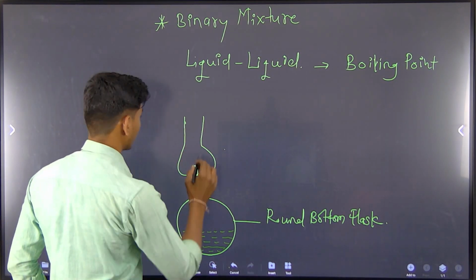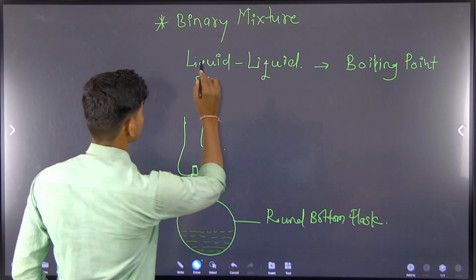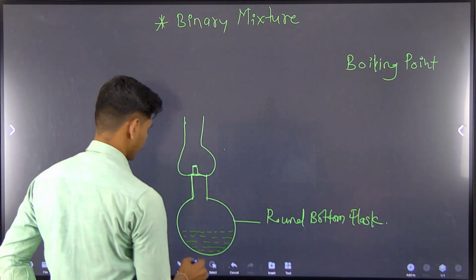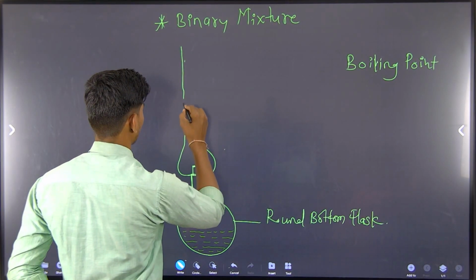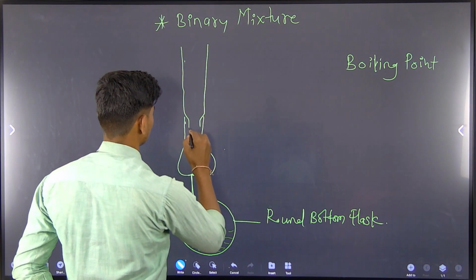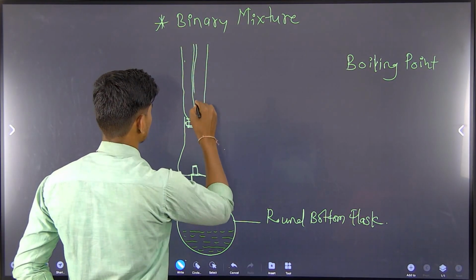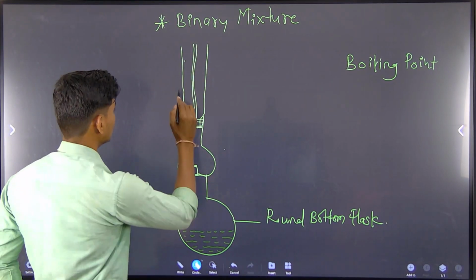After the attachment of the Hickman head, we attach the water condenser. This is the water condenser, and there is a continuous flow of water here.